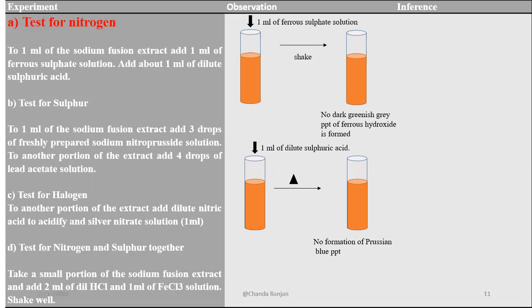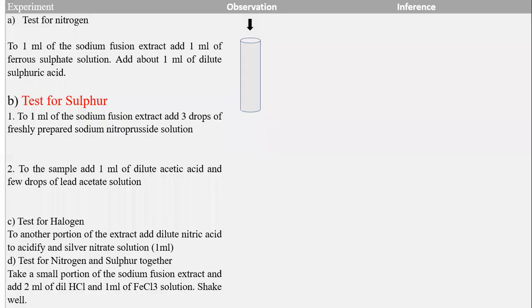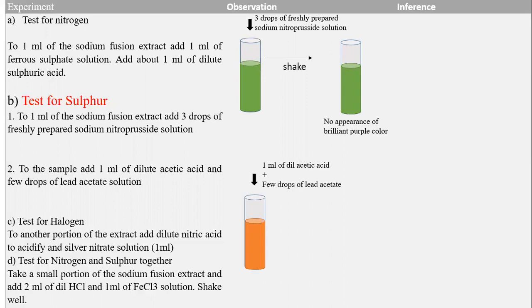Here we are not getting the Prussian blue color, so nitrogen is absent. We will follow with the test for sulfur. We take the test tube with the sample and add 3 drops of freshly prepared sodium nitroprusside solution and shake it. If we get a brilliant purple color, it shows the presence of sulfur; absence of color indicates absence of sulfur.